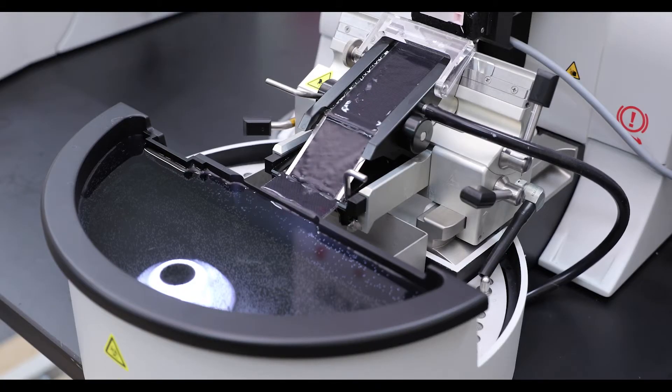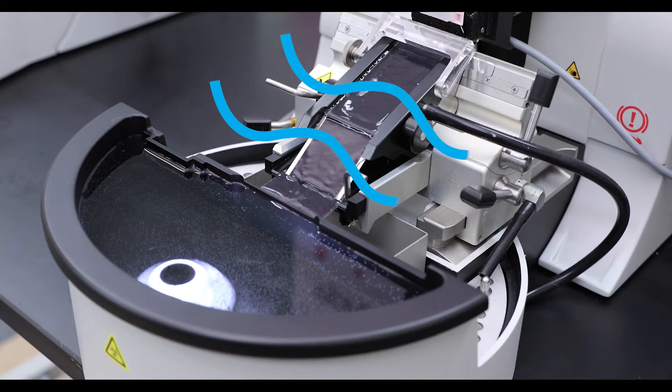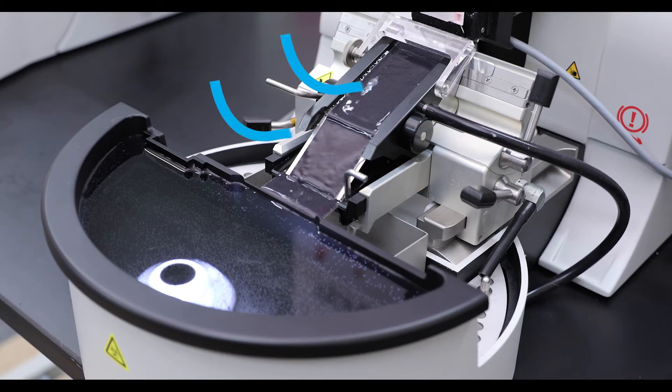An added benefit of the section transfer system is that it can eliminate issues that you might experience in a draughty environment by transferring the section directly on the water.